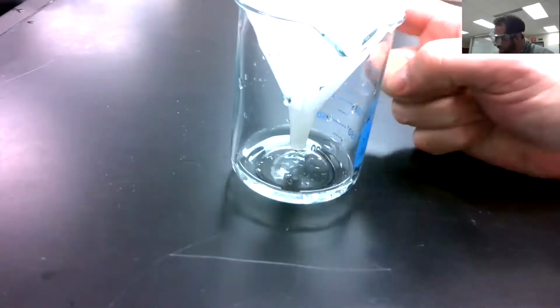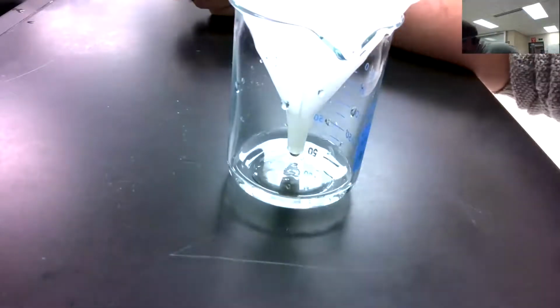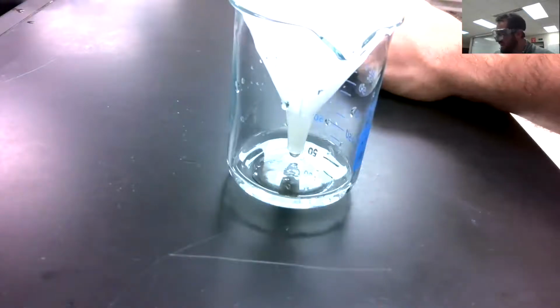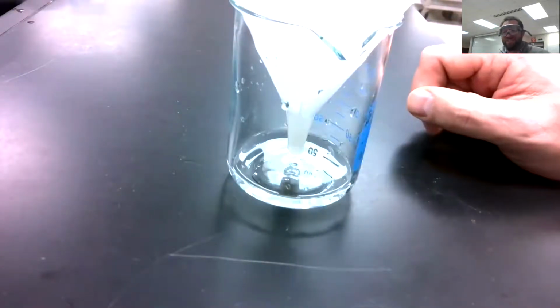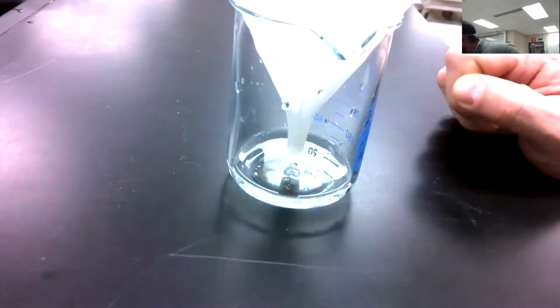Couple more drips, and we should be good to pull out our filter paper and set it aside for drying on Monday. Come on, little guy. Hooray! There it is. All right. Boy, the excitement of chemistry.